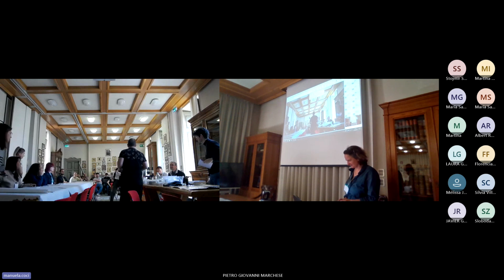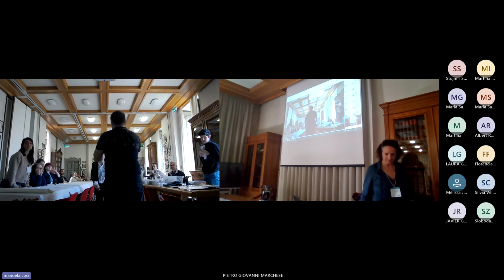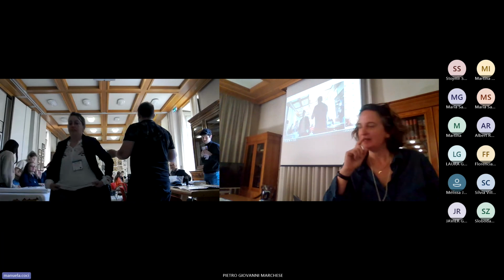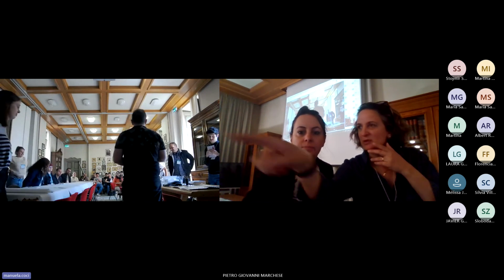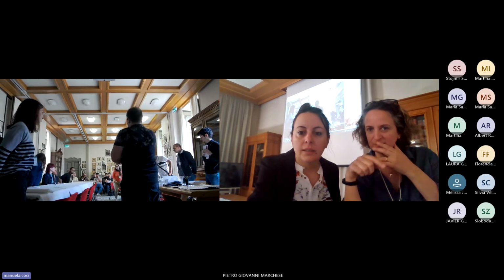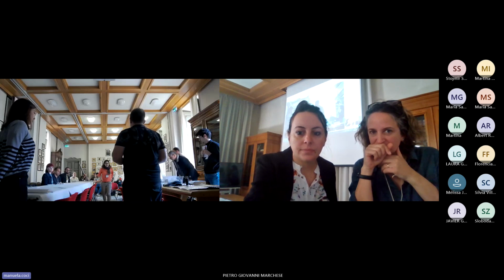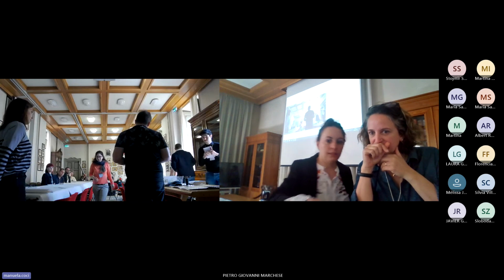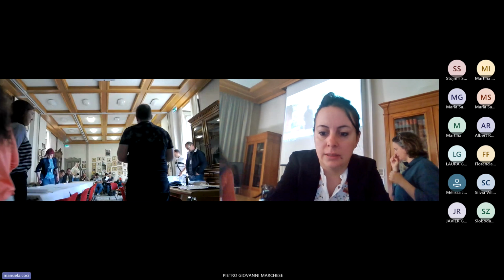Thank you for that. If you want, you can try to make your first microcapillary. Then we could start a simple experiment with the cyanobacteria. Enjoy.